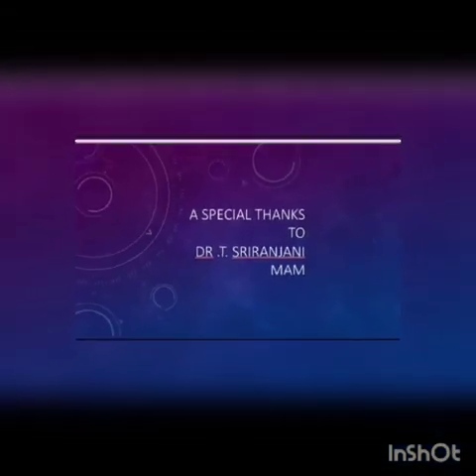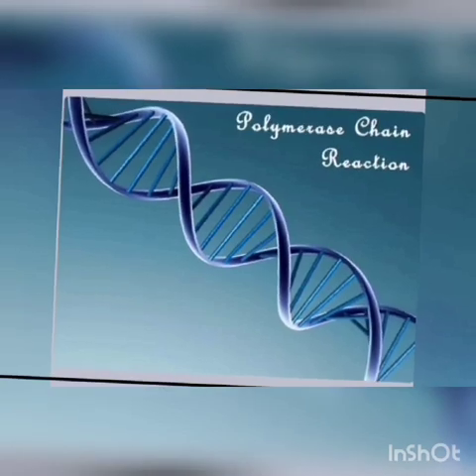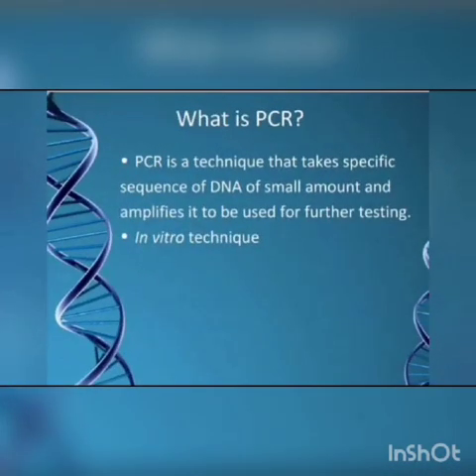Today my topic is PCR. PCR stands for Polymerase Chain Reaction. Now let us discuss PCR. Now see what a PCR is. PCR is a technique used in a lab to make several copies of a particular section of DNA.